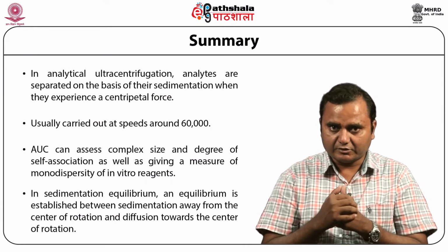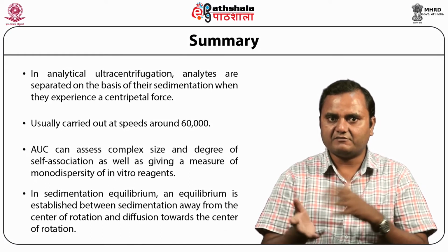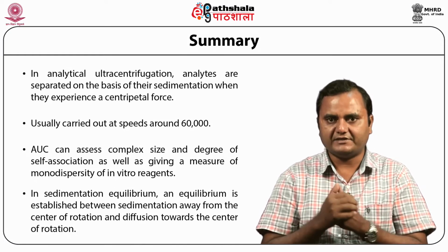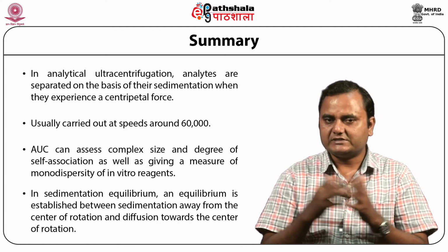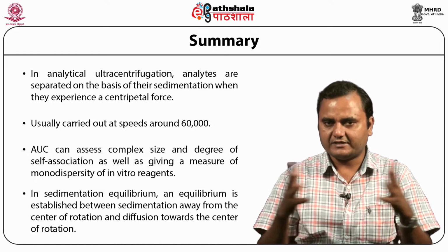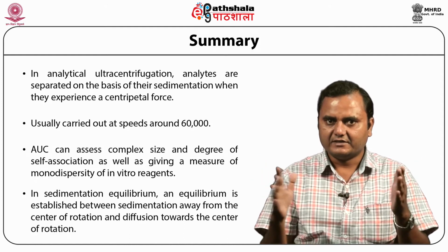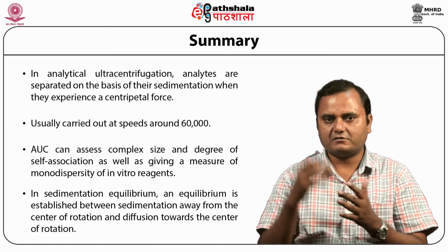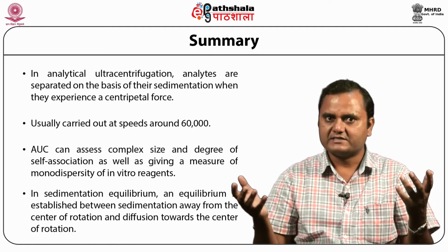Sedimentation equilibrium is an equilibrium established between sedimentation away from the center and diffusion towards the center of rotation. So this is all about the analytical ultracentrifuge. I think now you are much more aware of this. You have already seen all the details: the structure, the components, how it operates, everything.